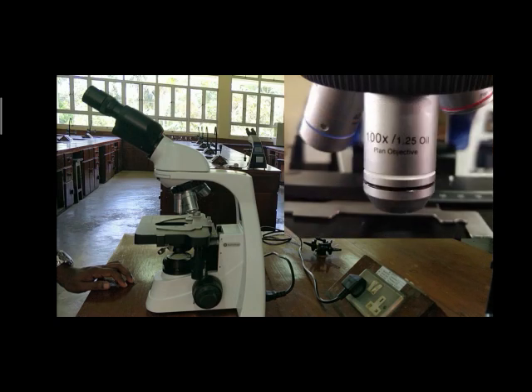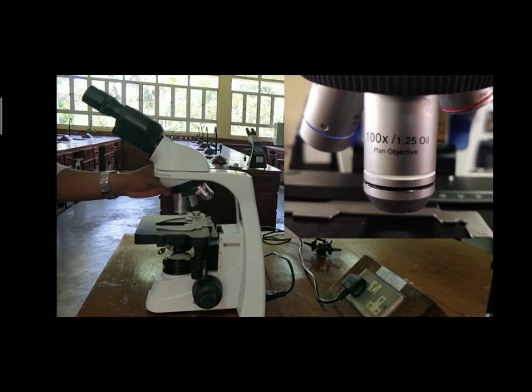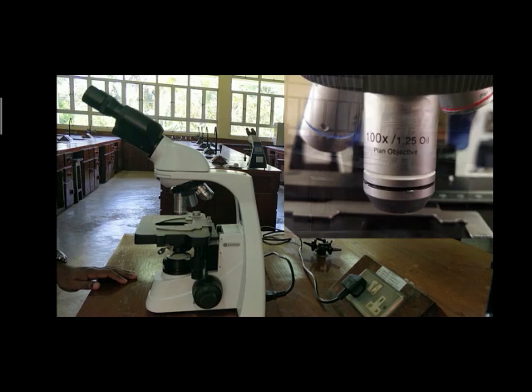Then the oil immersion of 100 times magnification for the confirmation of the stages of malarial parasites and species identification of filarial parasites.